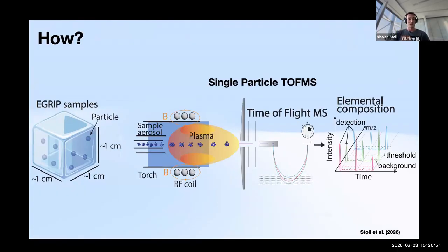Okay, another one is single particle analysis. This is a very classic chemical method. So you melt your ice sample. This is the first method I show you here, which really melts the ice, and then you can't use it anymore. So it's usually something we use in the very end.